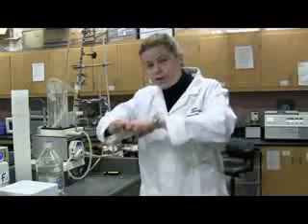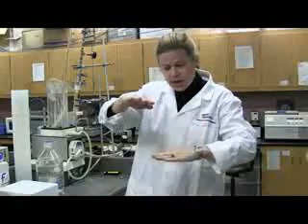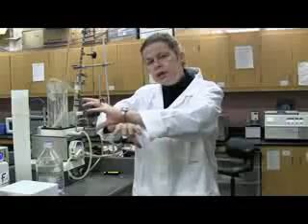But the special thing about ultrafiltration is that it is cross-flow, which means that the bulk fluid flows past the membrane, and because there's a pressure drop across the membrane, some of the fluid goes through the membrane. So, depending on what is in the bulk feed fluid, there will be some smaller molecules that go through the membrane, but even some of the small ones will not go through because there's a bulk flow that carries them along.